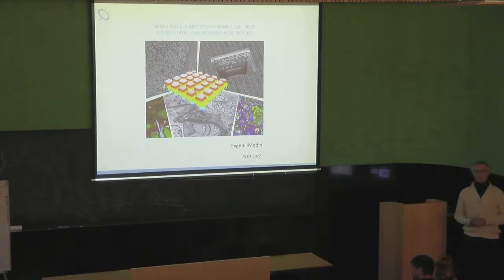But the budget was too low, so we asked for the possibility of upgrading this tool with a SIMS spectrometer. And it appeared that the company managed to fit it to the budget. So on top of the cryo high rate removal tool, we also got, or are going to get, the TOF-SIMS on the tool, which would make it the second tool of this kind worldwide, and the first in Europe.